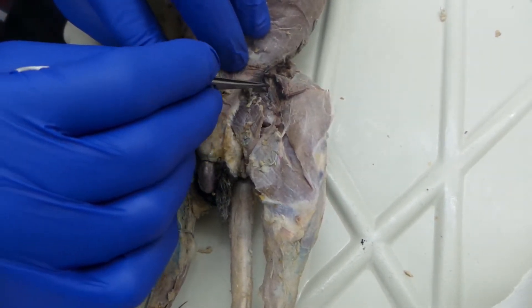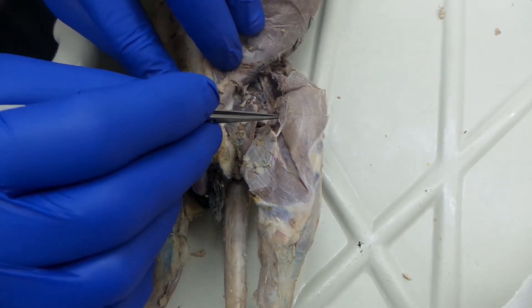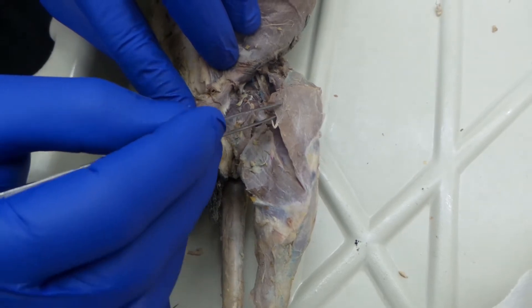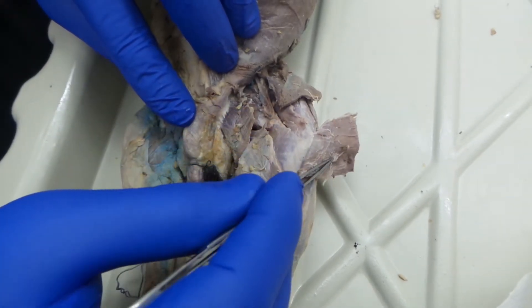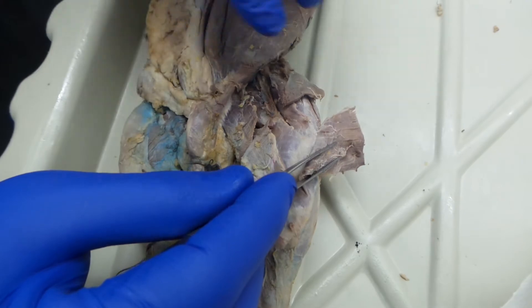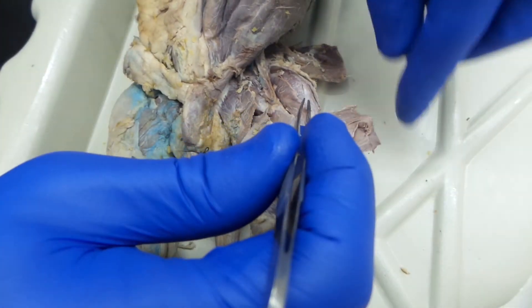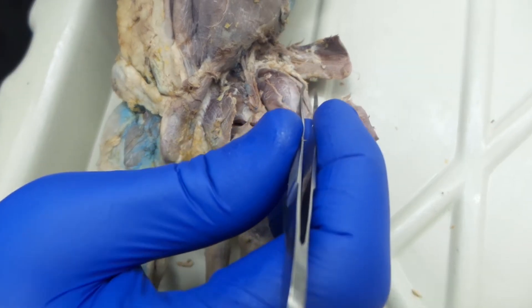One of the landmarks is these blood vessels right here. What you want to do is just kind of lift these. There's going to be a little bit of fat to help you along. Cut through the belly of that muscle so you can pull back your sartorius. And then from there, you can see a handful of other muscles.